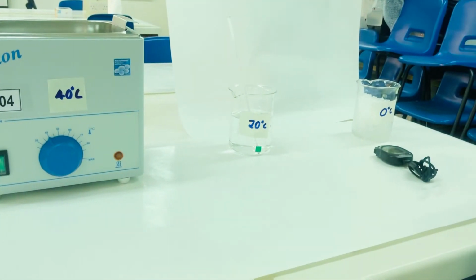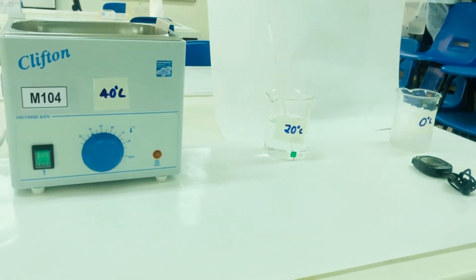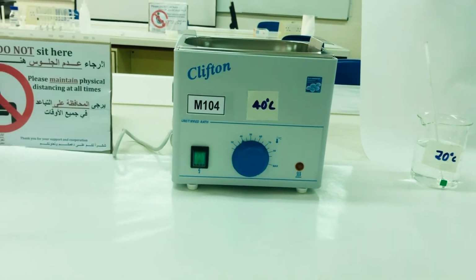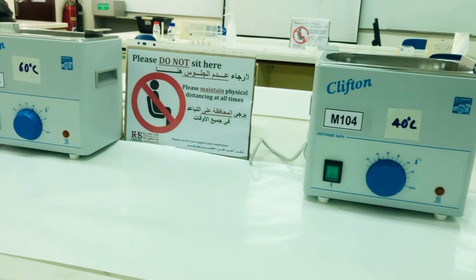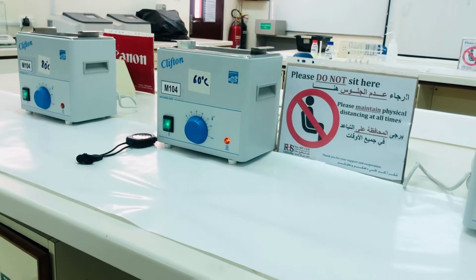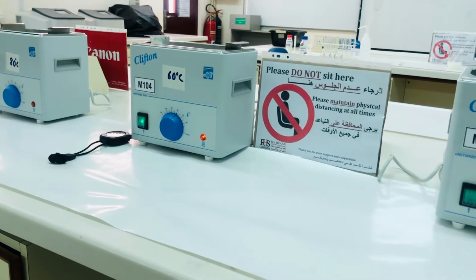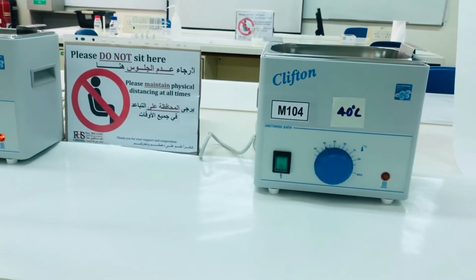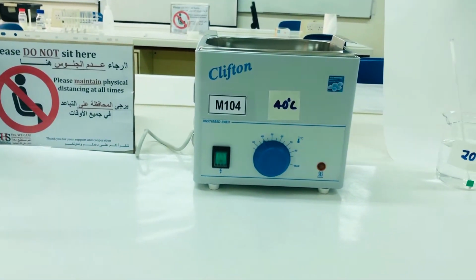There is a water bath at 0 degree, 20 degree, 40 degree, 60 degree and at 80 degree. The time taken in the experiment will be recorded with the help of a stopwatch.